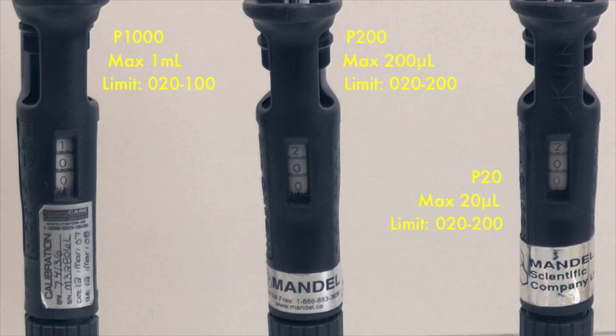For any volume lower than 200 microliters, you need to go to the next available pipetment, which is the P200. For P200, the range is between 20 microliters to 200 microliters, denoted by 020 to 200 on the dial.